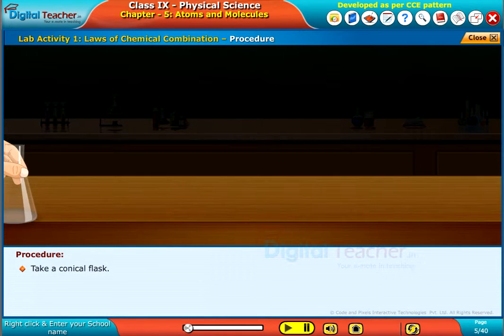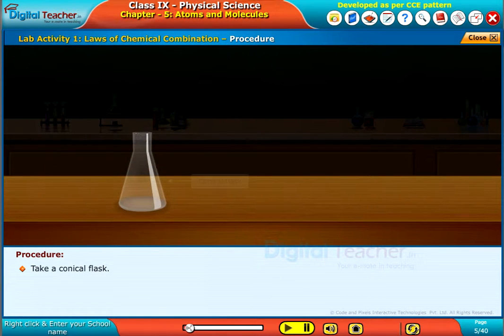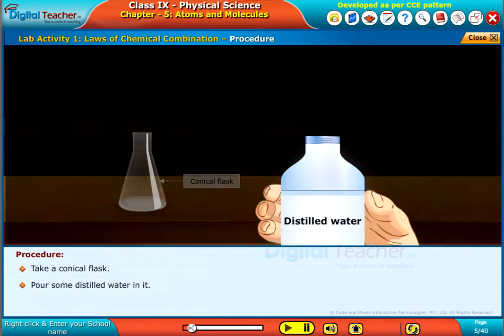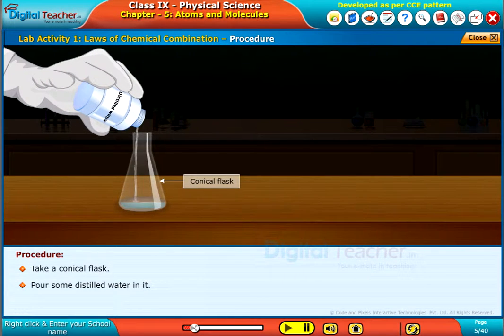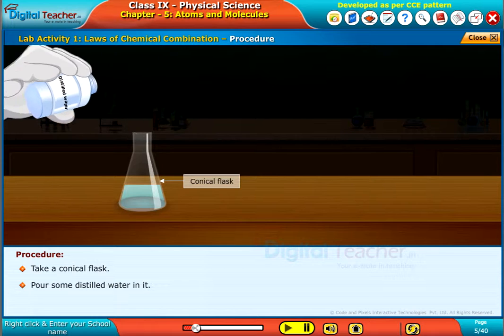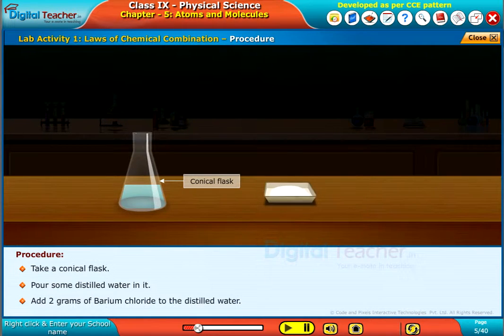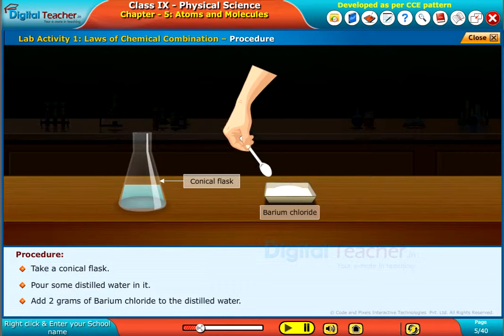Take a conical flask. Pour some distilled water in it. Add 2 grams of barium chloride to the distilled water.